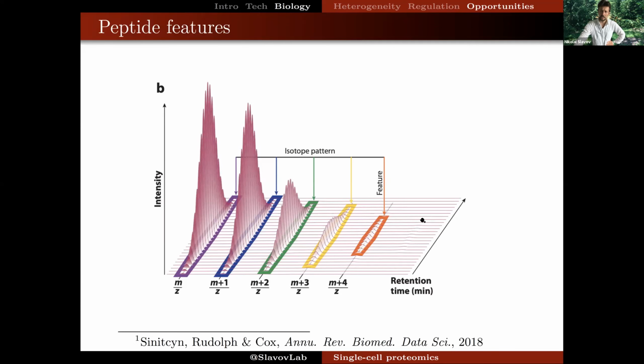So at the very end, I want to return a bit to the technological aspect. Having told you what we can do now, I want to tell you that this is nowhere close to the asymptote of the field. This is not mature. These are just early baby steps. And for that, I'll just introduce to you how a peptide looks to the mass spec instrument. It looks like this peptide feature. So this is a data object composed of usually hundreds of measurements. It's not a blip on the detector.